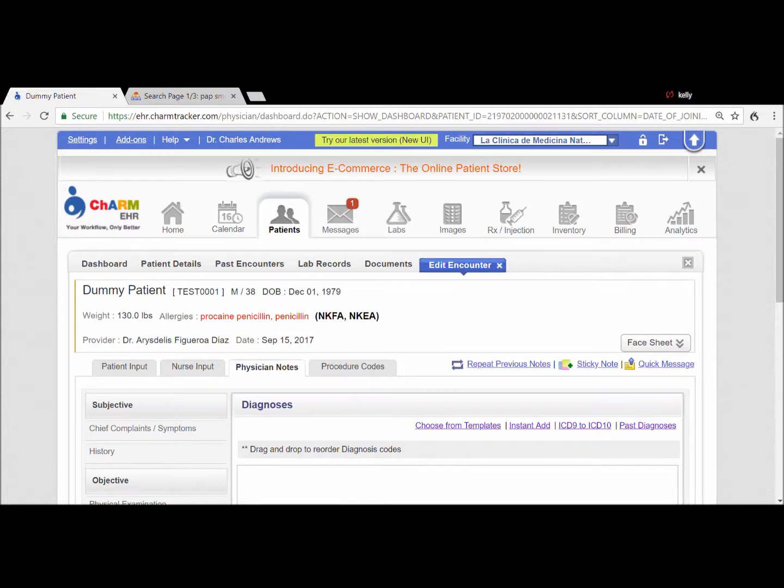Greetings. Today I will be showing you how to put in an order with Puerto Rico Pathology for cytology, chlamydia, trichomonas, or gonorrhea, and HPV virus.